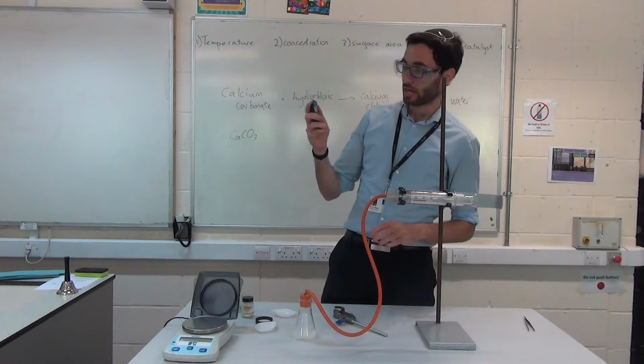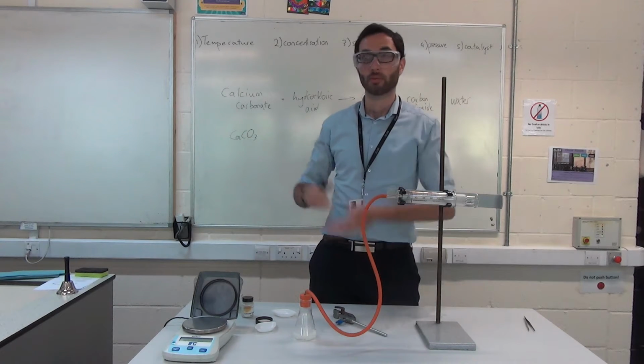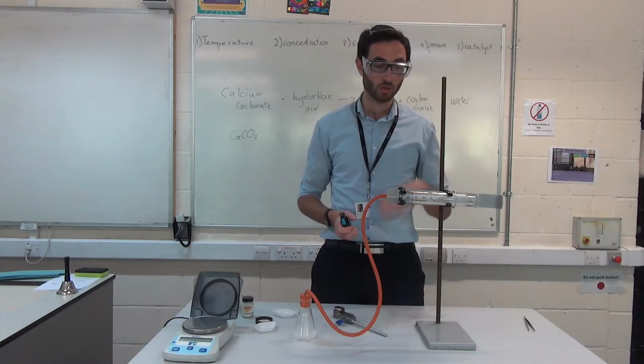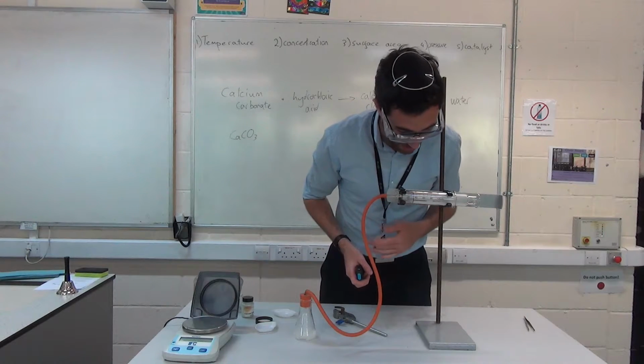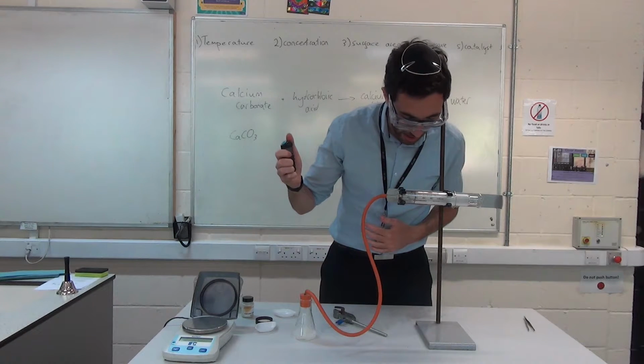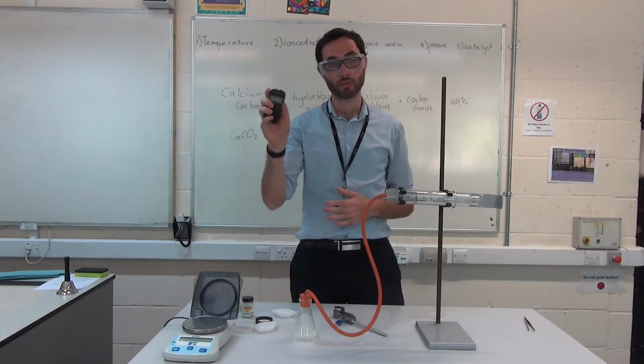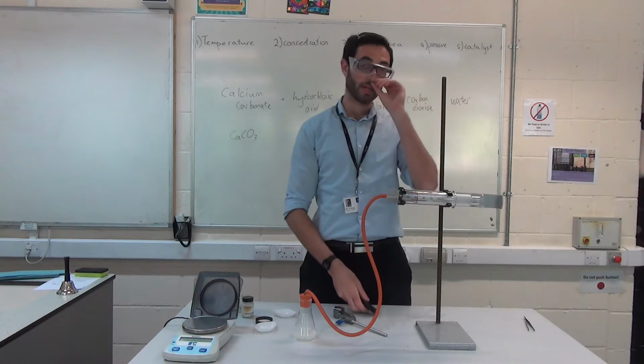So I've given that now, I'll get 40, it doesn't matter, I can say, right, I'm going to pause it a minute and see how much I've got, or I can wait till it hits 50 and stop it there. Now in this case, for the sake of time, I'm going to wait till it hits 40, and boom, done. 51 seconds, 44, and I'd record that in the table.